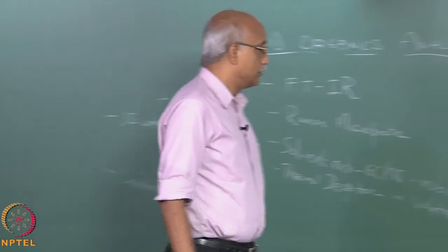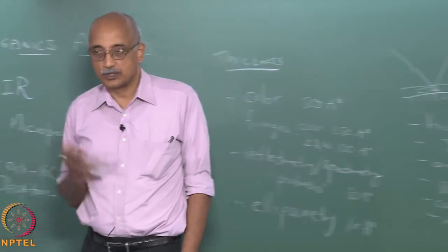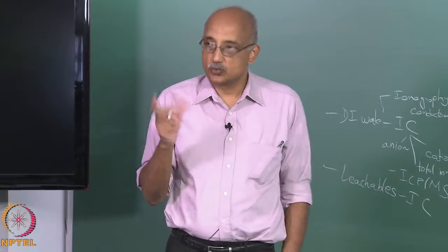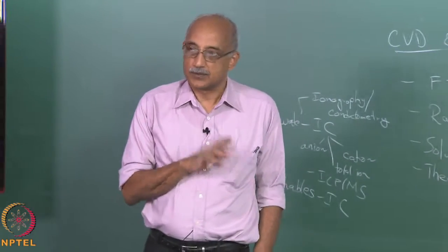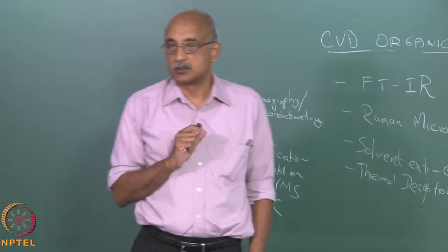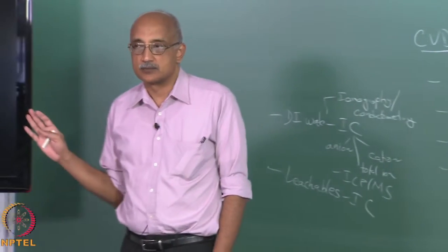And then you look at how the change in the plane of polarization varies with thickness. The thickness is then a very, very sensitive influence on the extent to which this rotation happens. And you're able to get a very precise answer on the thickness of the film using this ellipsometer technique. The ellipsometer is quite a capital intensive equipment, close to $1 million. But once you have it, it's very easy to use. It's essentially virtually a push button operation.